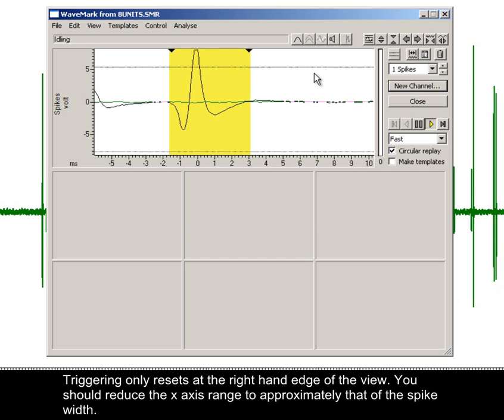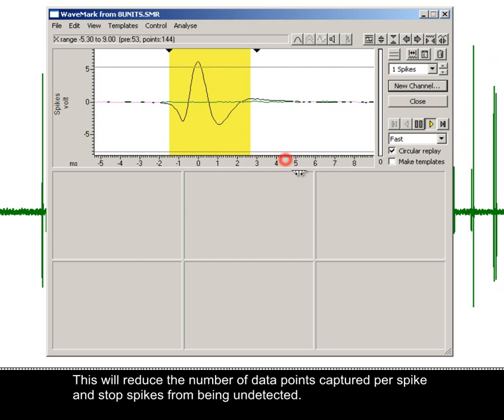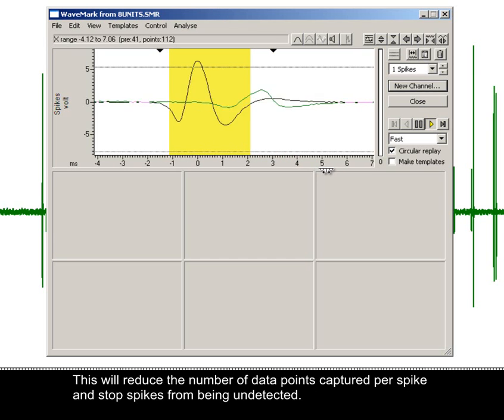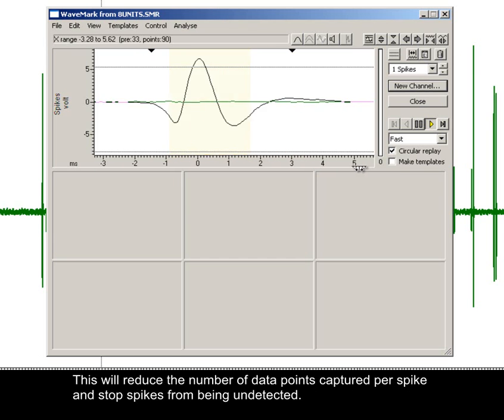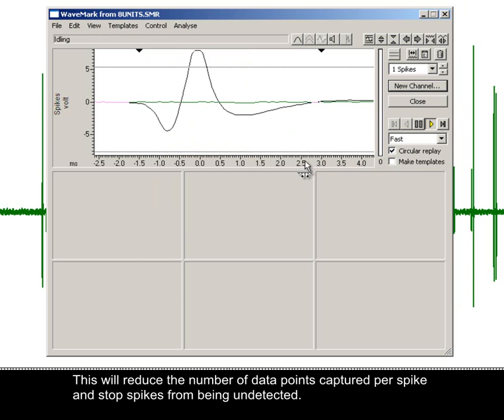You should reduce the x-axis range to approximately that of the spike width. This will reduce the number of data points captured per spike and stop spikes from being undetected.